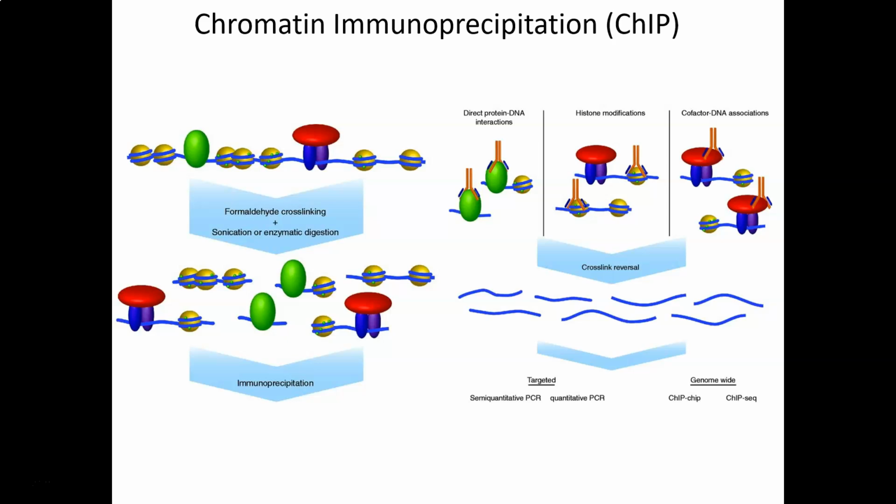So we're going to add primers to our specific DNA of interest, and we're going to ask the question, is this PCR-able? Right? So if we're doing a ChIP experiment on the gene AMB1, and maybe we chipped for ROX1, if we think back on that example of coordinated regulation from a couple weeks ago, ROX1 as a transcription factor binds to the promoter of AMB1. So now imagine we cross-link those cells. ROX1 was bound. We glue ROX1 to the AMB1 promoter.